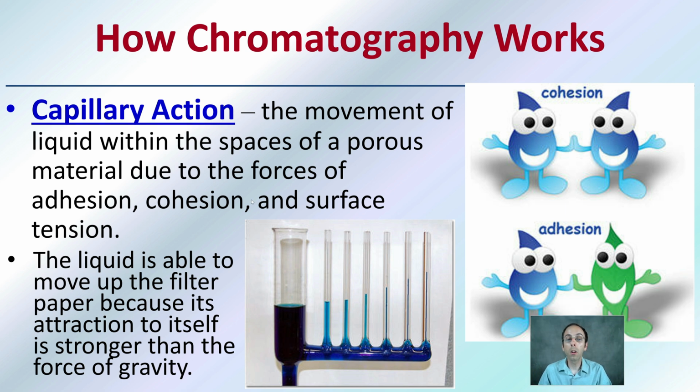Well, it works through what's called capillary action, and that's the movement of a liquid within the spaces of porous material due to the forces of adhesion, cohesion, and surface tension. Here we see blue liquid, and we see the different diameters of these glass tubes. As that diameter gets smaller, we're noticing that liquid is able to travel higher, and that's through capillary action.